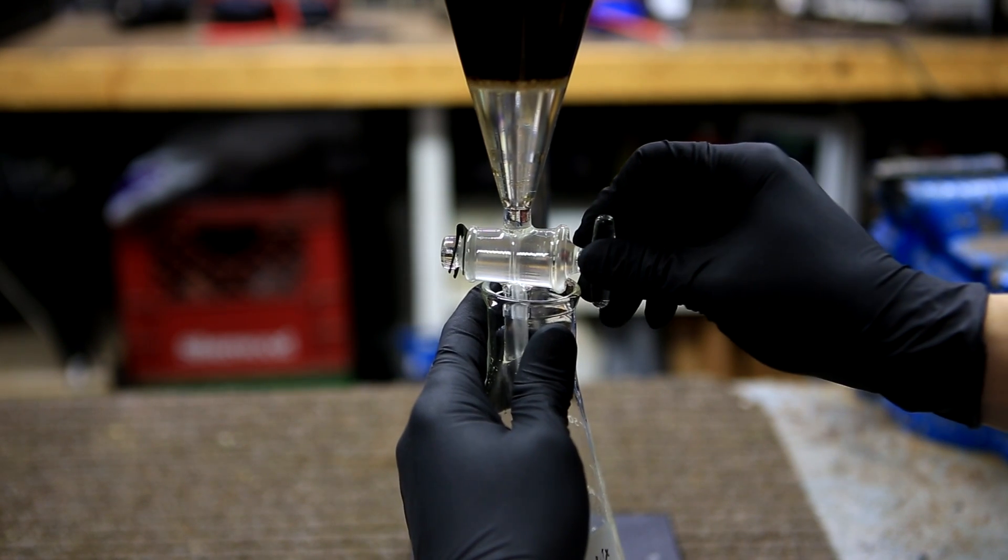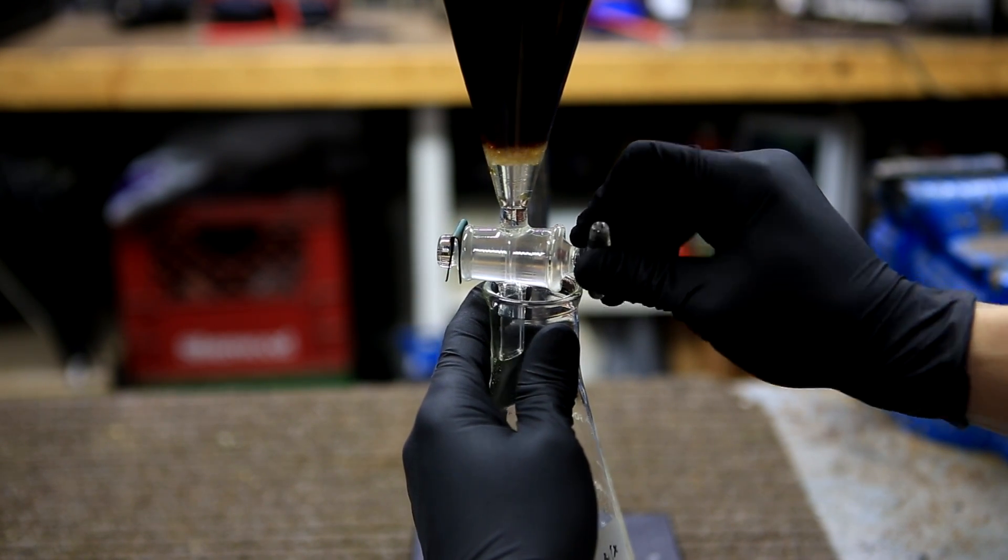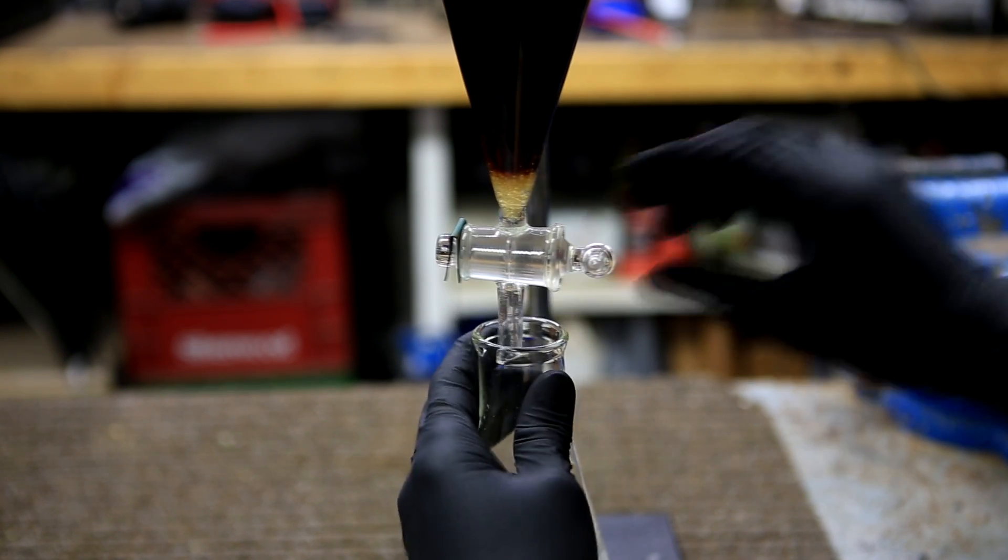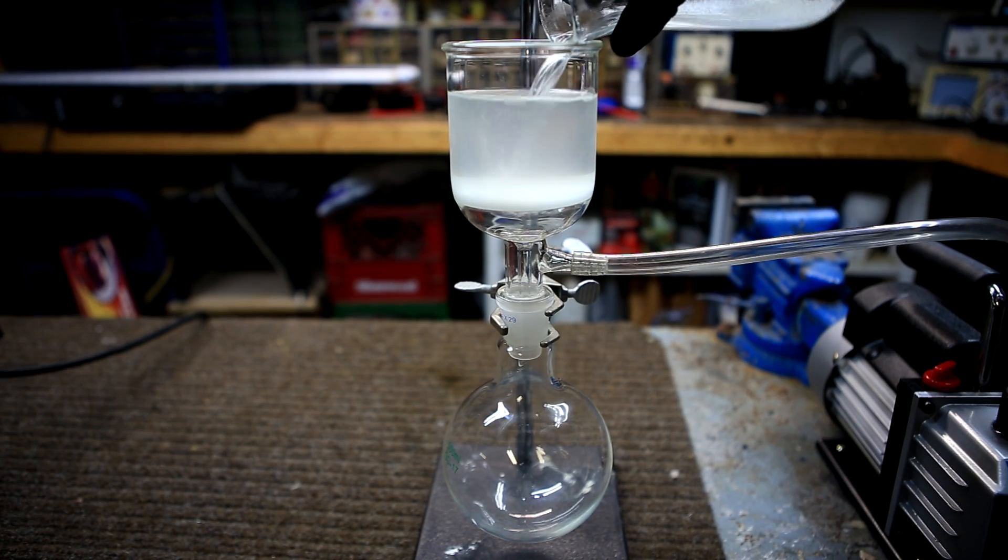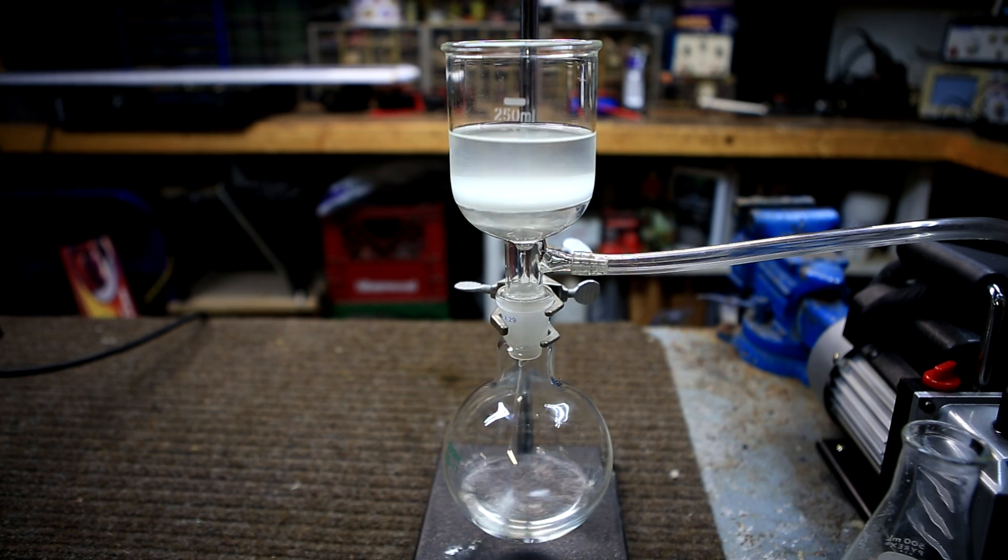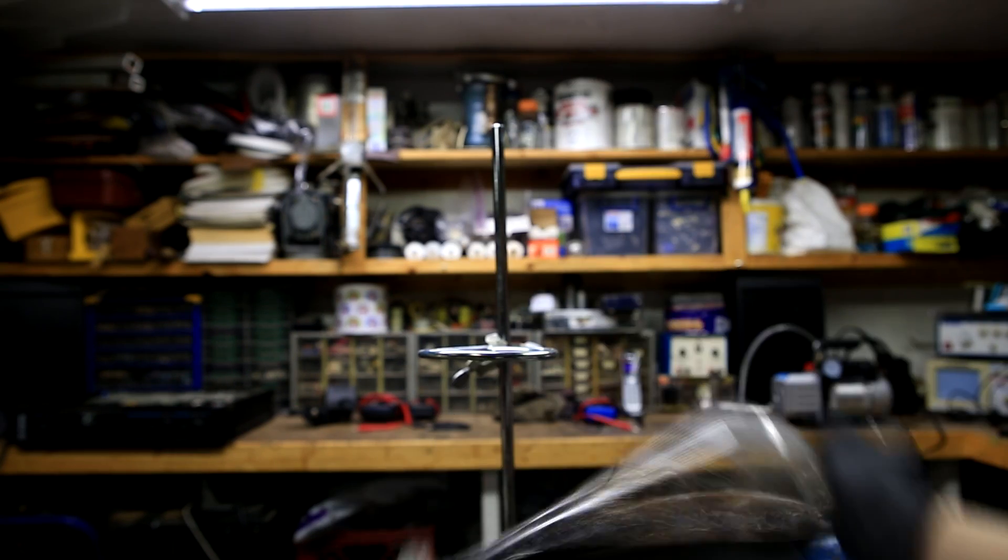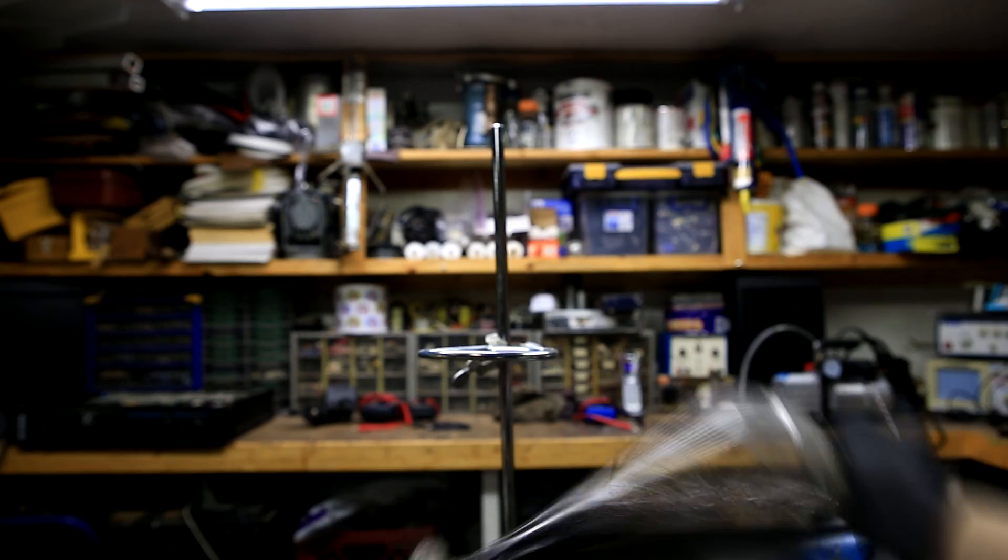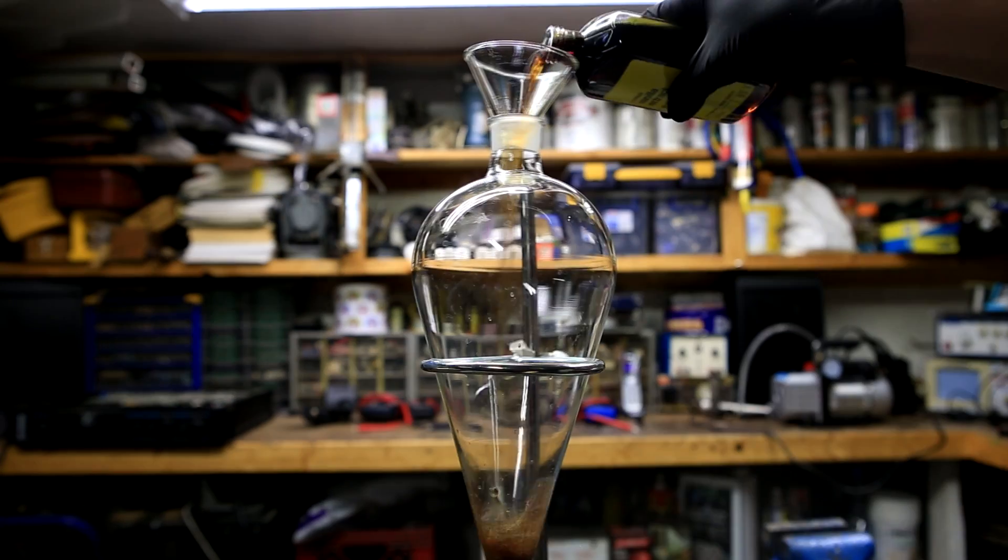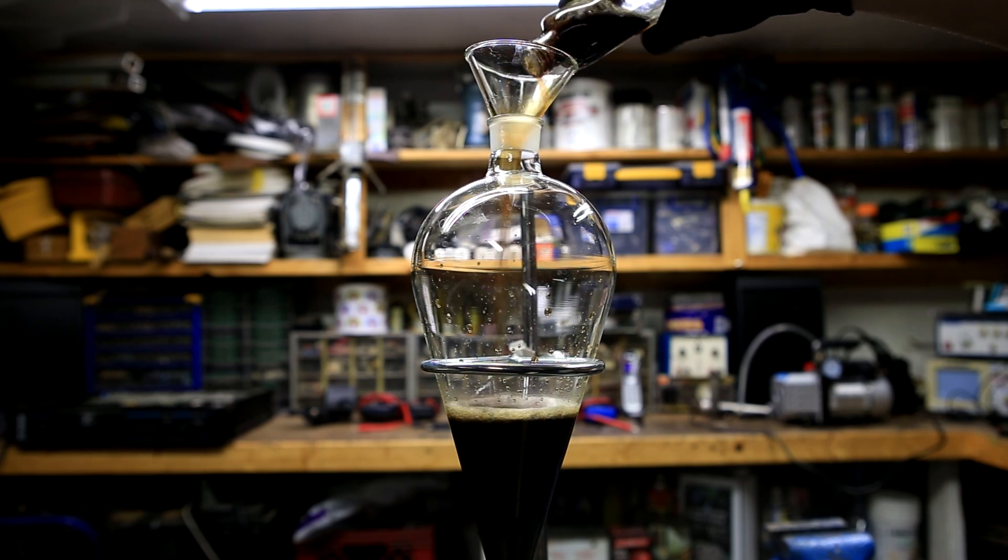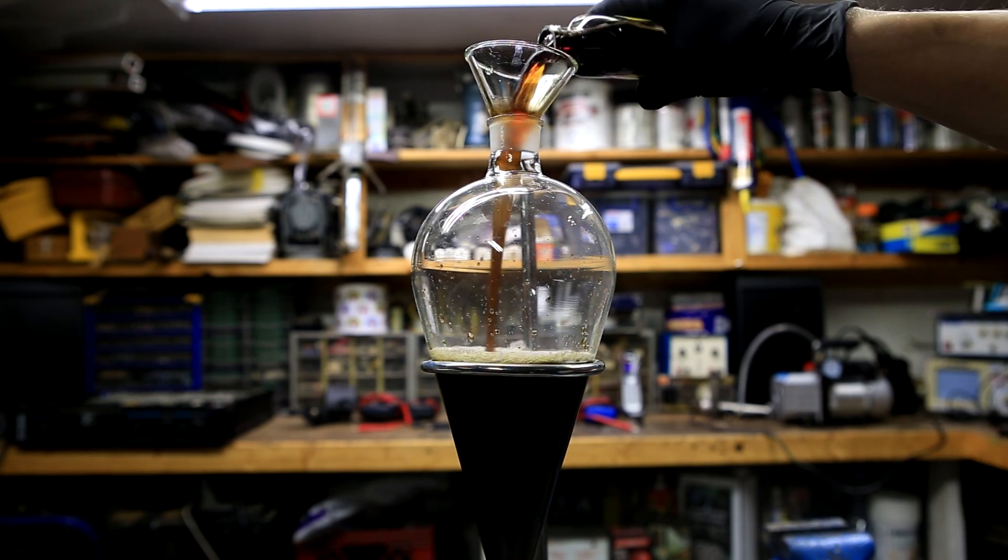Vanillin is the major flavor component of vanilla and the majority produced is used in food. However, vanillin is also a useful chemical precursor for other large molecules. I'm particularly interested in it because it's used as a precursor in the synthesis of capsaicin and other capsaicinoids. In this video we'll be extracting vanillin from store-bought liquid vanilla extract.